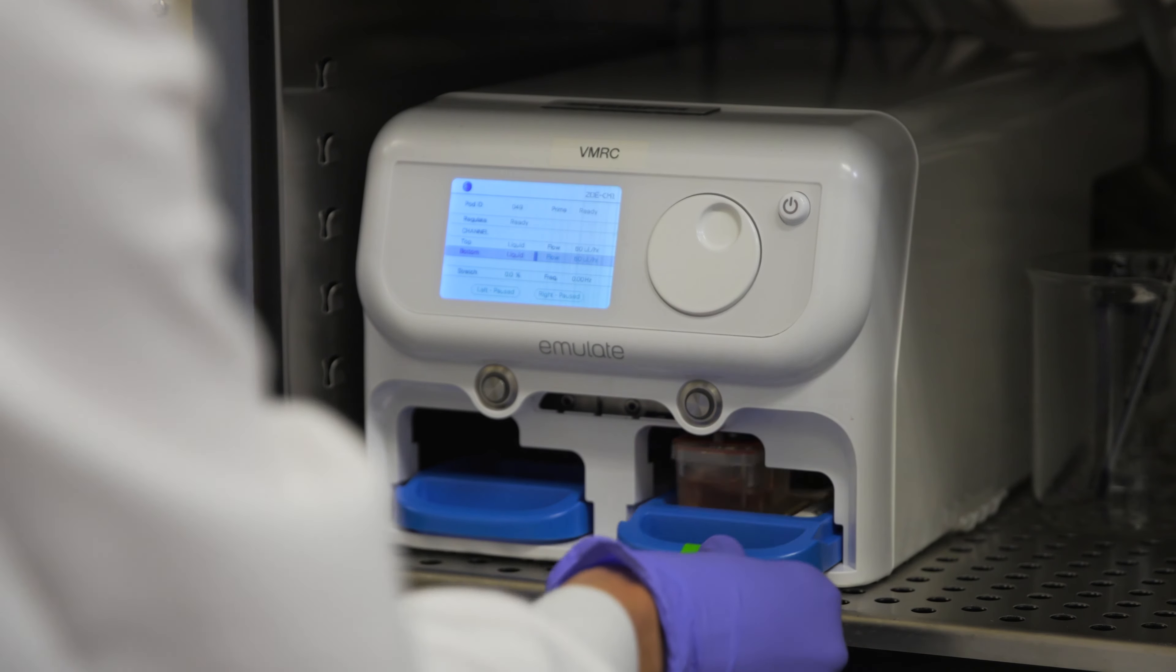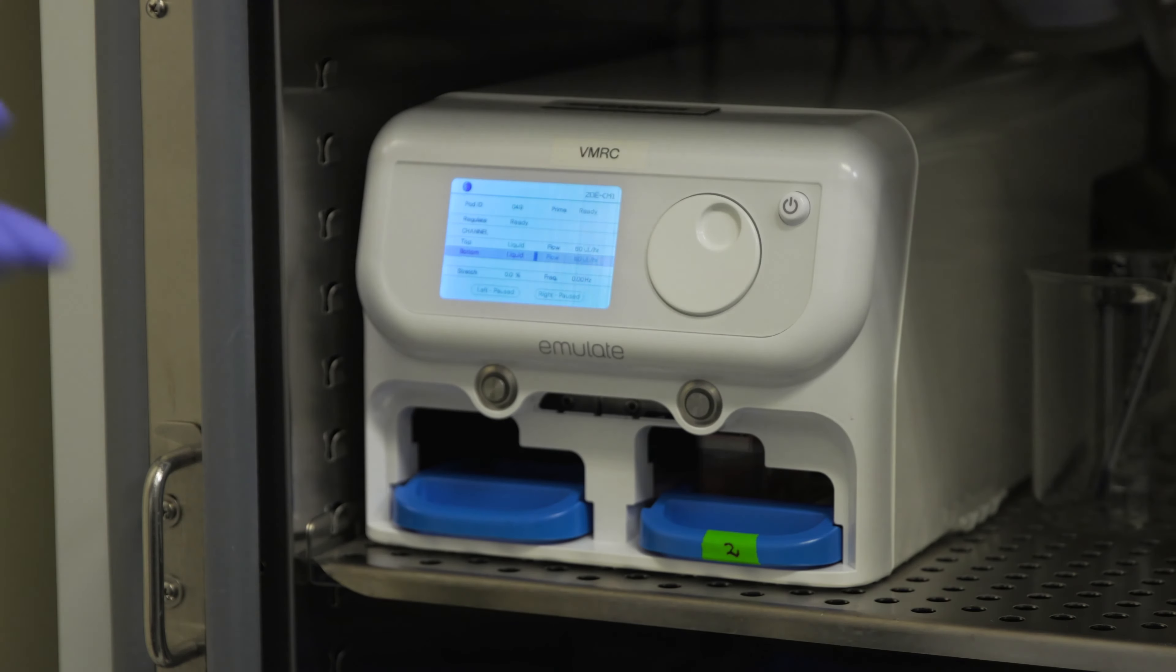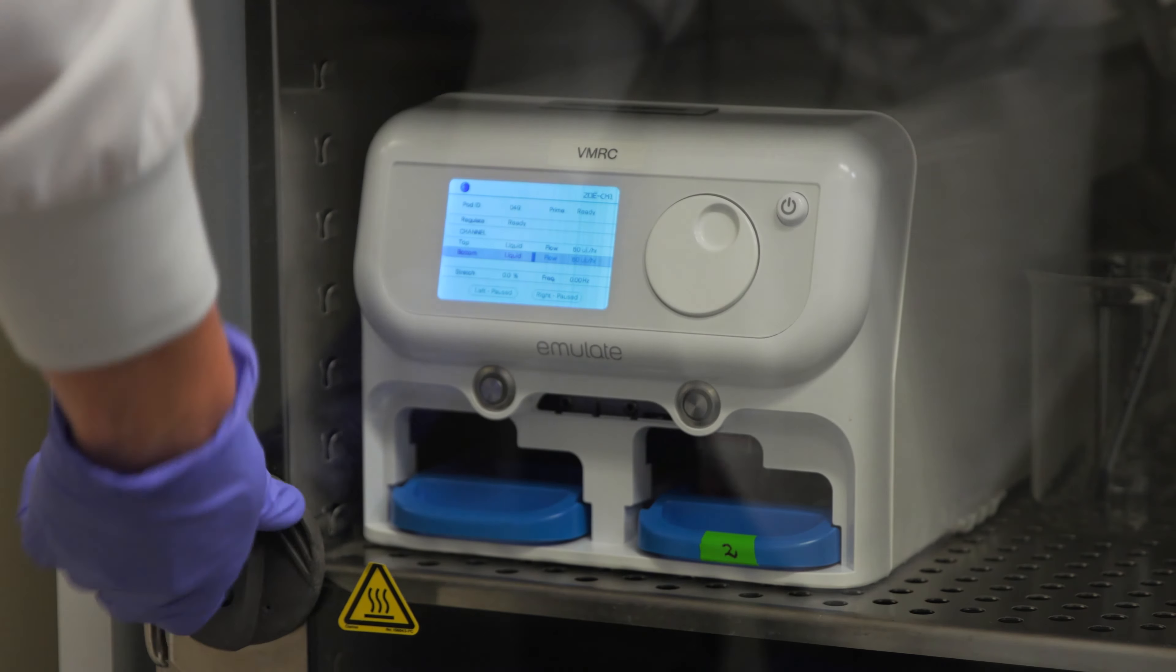Using the human organ chips, we were able to generate a mucus layer in vitro similar to that found in the human colon. This has never been done before.